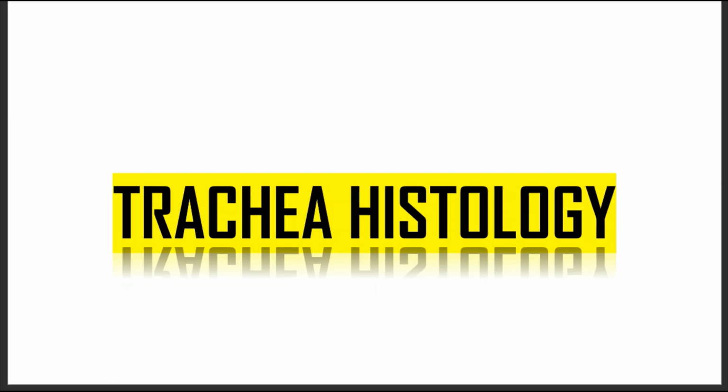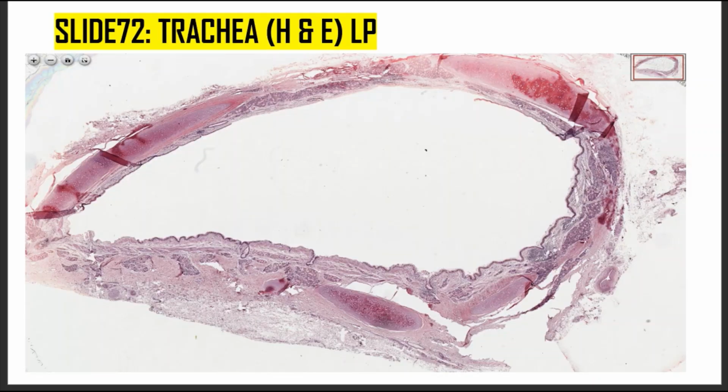Now let's look at the trachea, the histology of the trachea. So at low power, this is the trachea. This is the lumen of the trachea. You can see the trachea is made up of pseudostratified columnar epithelium with cilia.